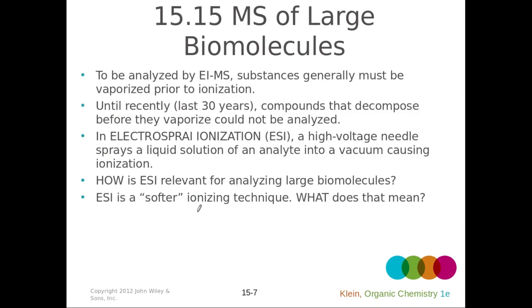Another application for mass spectrometry is to analyze large biomolecules. Previously, like 30 years ago, these large molecules like proteins couldn't be analyzed in mass spectrometry because they were just too big. They would break apart when they were ionized with electron impact ionization techniques.